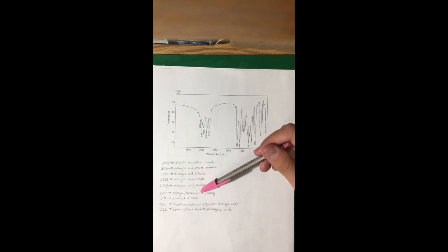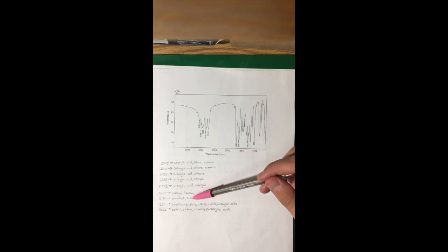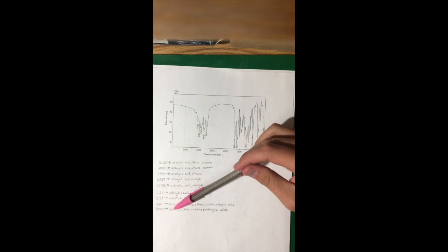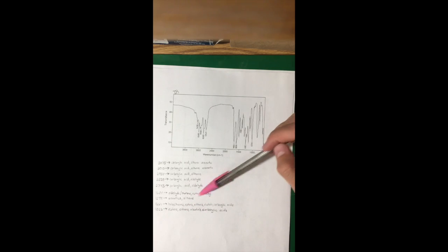And then this next one moves down here, 1684, found to be an aldehyde or ketone, an ester, or a carbonyl, which could be very useful with the 2 oxygens. 1599, aromatic alkene again. 1261, haloalkanes, esters, ethers, alcohols, and carboxylic acids. And the last one is again an ether, alcohols, and a carboxylic acid. So we have a very strong correlation that we are going to have some type of ester or ether within this molecule.